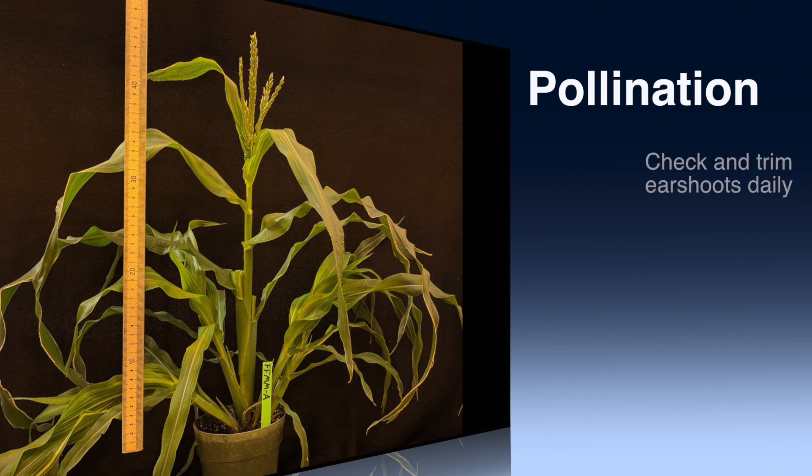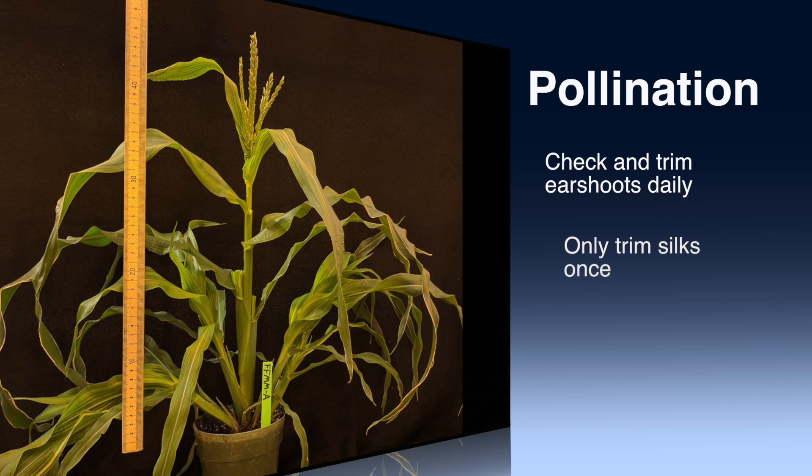Check under earshoot bags daily and trim the flag leaves back so that one to two centimeters remain, then recover. This will prevent the flag leaves from knocking off the earshoot bag as they grow. If silks are cut, pollination can be performed the next day or up to three days later. Indicate that the silks have been cut by folding over the tip of the earshoot bag or marking the bag with a marker. Do not cut silks a second time because they may fail to regrow.